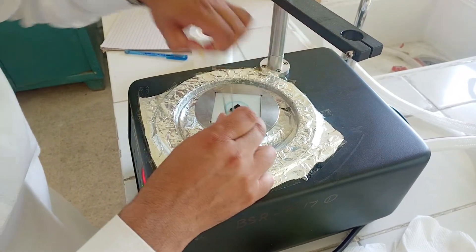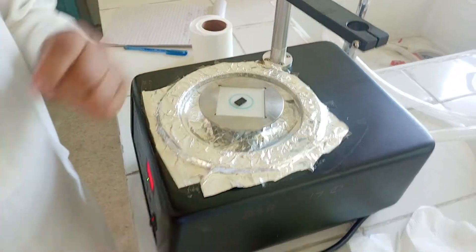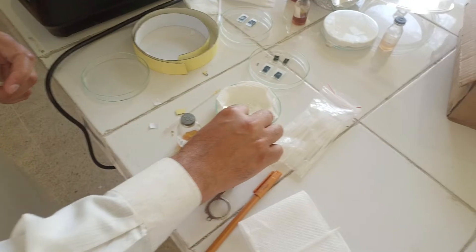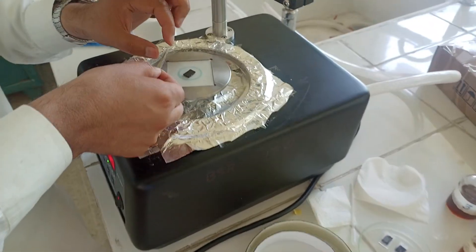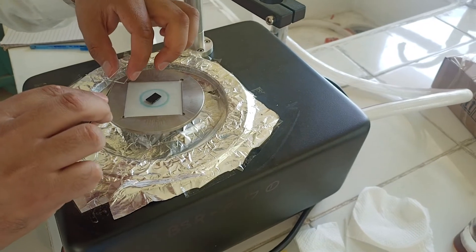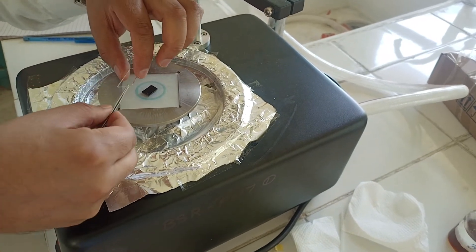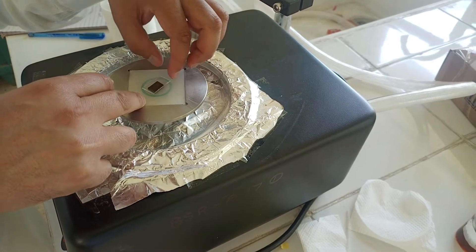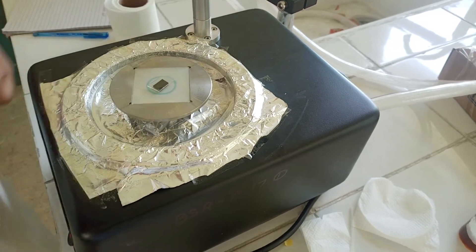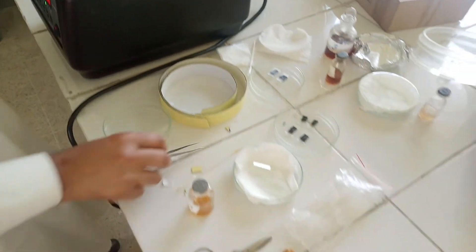Now we will take our slide and adjust our slide on it. We can use forceps by taking the side of the glass. Now we will cover it.